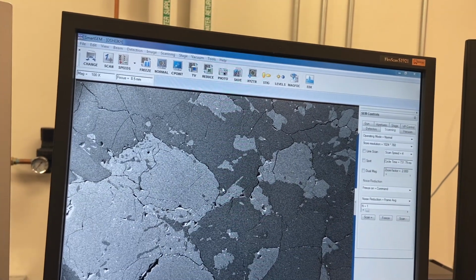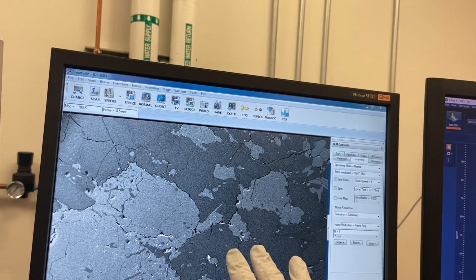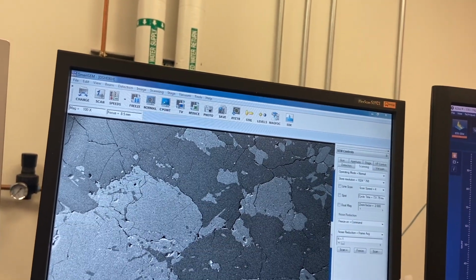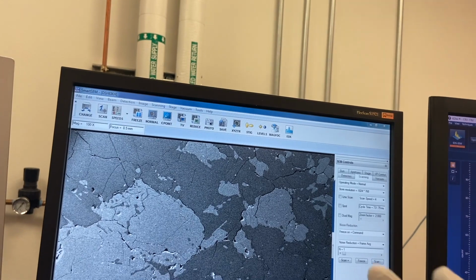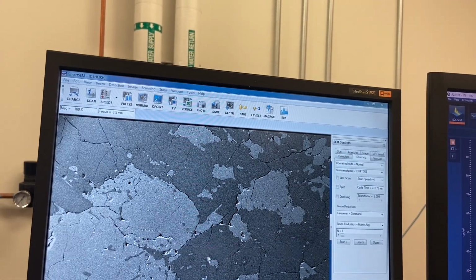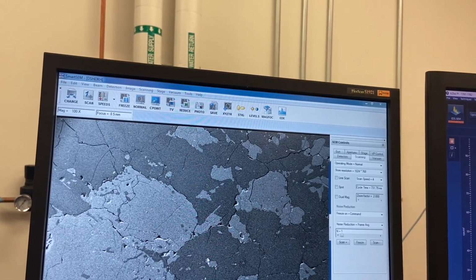Obviously I'm not using secondary electrons when I do my analysis. I just use them first, and then I use backscatter electrons, which provide more of a density contrast. But secondary electrons can also give you some information on the density. We mostly use those for superficial features, so if you have changes in elevation, topography, very minute details.